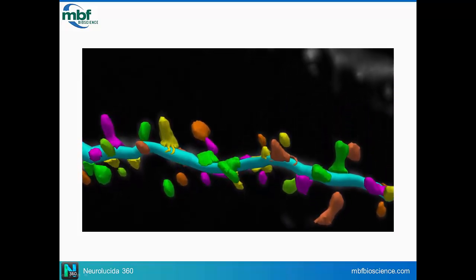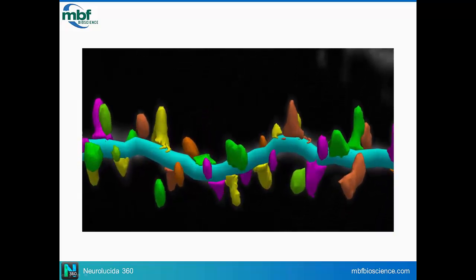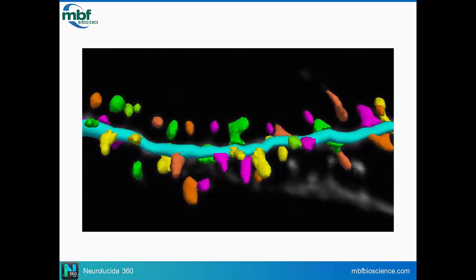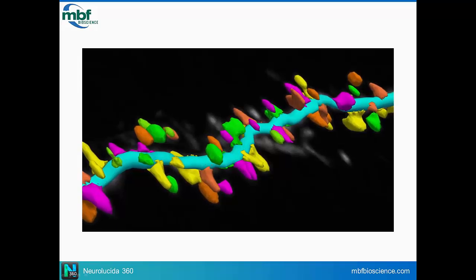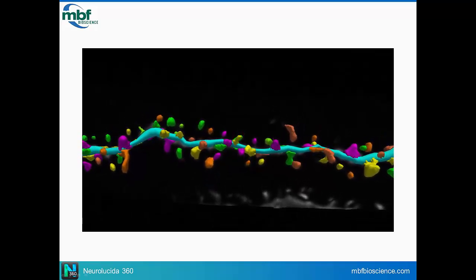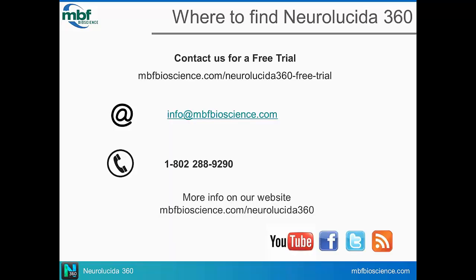Interesting. For us, since we're not doing a stain, we're just doing injection, we don't have that problem of glial cell staining. The protocol that I mentioned for the cellular injection was optimized many years before I entered the lab here at Mount Sinai, through John Morrison and Patrick Hof's lab, who established the cell loading in the 90s or even before.